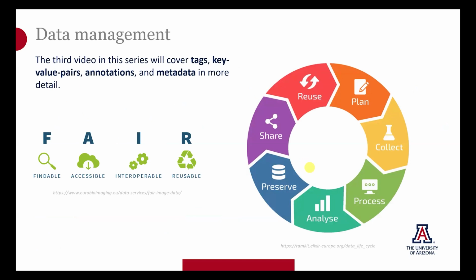In the third video of this series, we'll be talking about data management. And one of the goals of having OMERO at the University of Arizona was that we would be able to take advantage of the FAIR principles, where data is findable, accessible, interoperable, and reusable. We want labs to have a data management plan so that they go through the entire cycle of capturing data, processing it, preserving it, and sharing it. Often, you or the other members of your specific lab are the most likely persons to reuse your lab's data. You want to manage the data in such a way that future you is not frustrated with past you for not leaving enough information to know whether this is useful data or not.